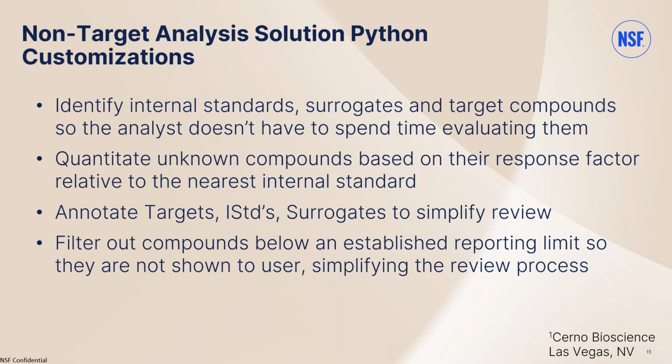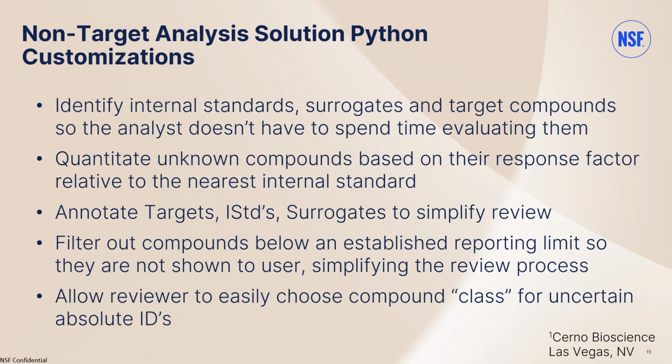And then finally, we have established reporting limits. So we wanted it to filter out any peaks that were below that reporting limit before the analyst even had to look at it, so they wouldn't waste their time identifying things only to find out that they were not going to be reportable. And then we wanted to be able to make some manual assignments for things where we didn't believe the library searches were correct.